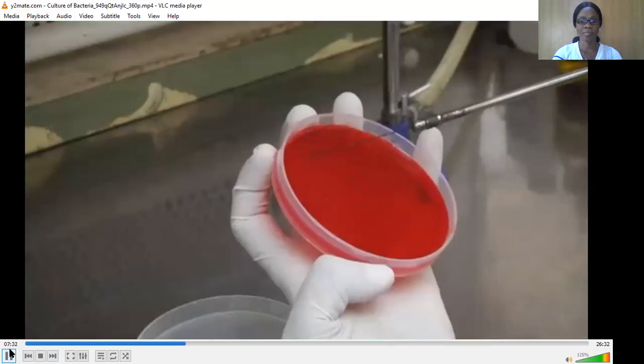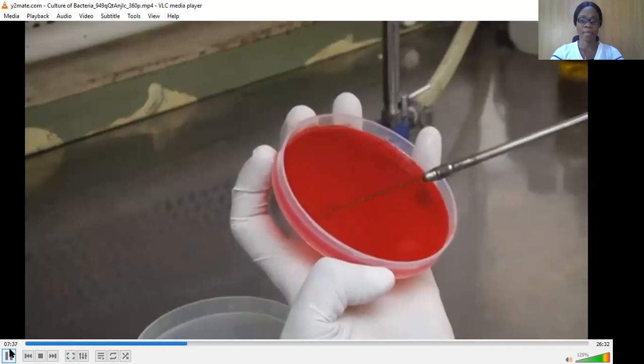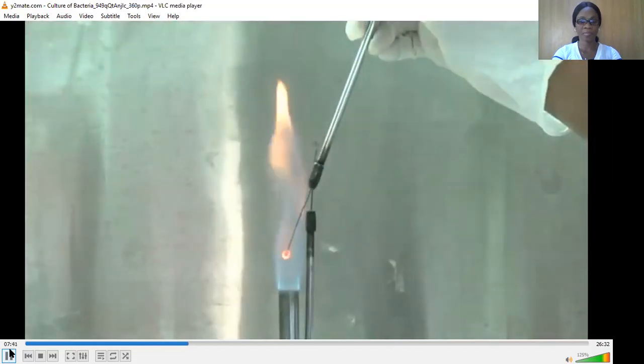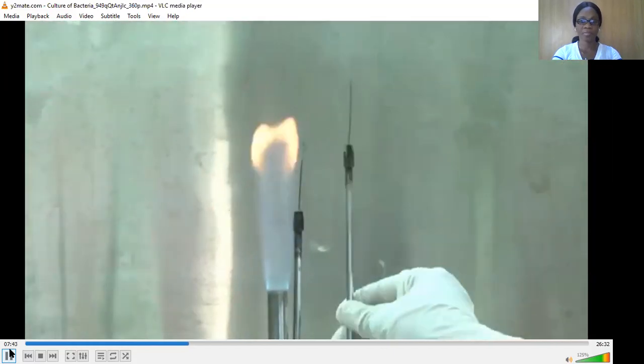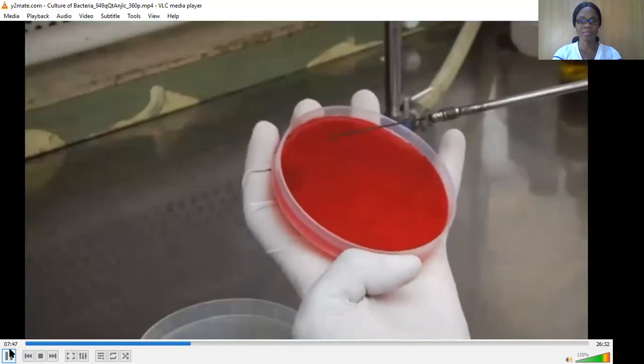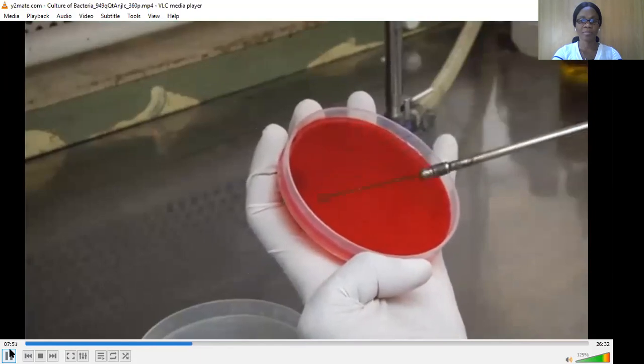Use the loop to draw three or four parallel lines from the well inoculum onto the fresh surface of the medium. Again, sterilize the loop and allow it to cool down. Then, draw three or four parallel lines from area B onto the fresh surface of the medium.